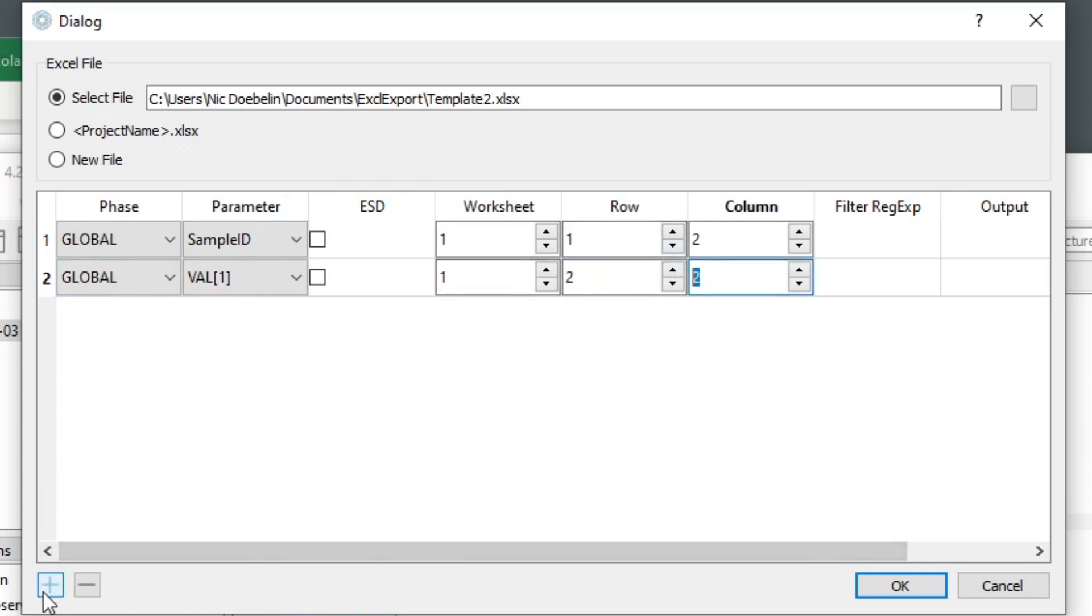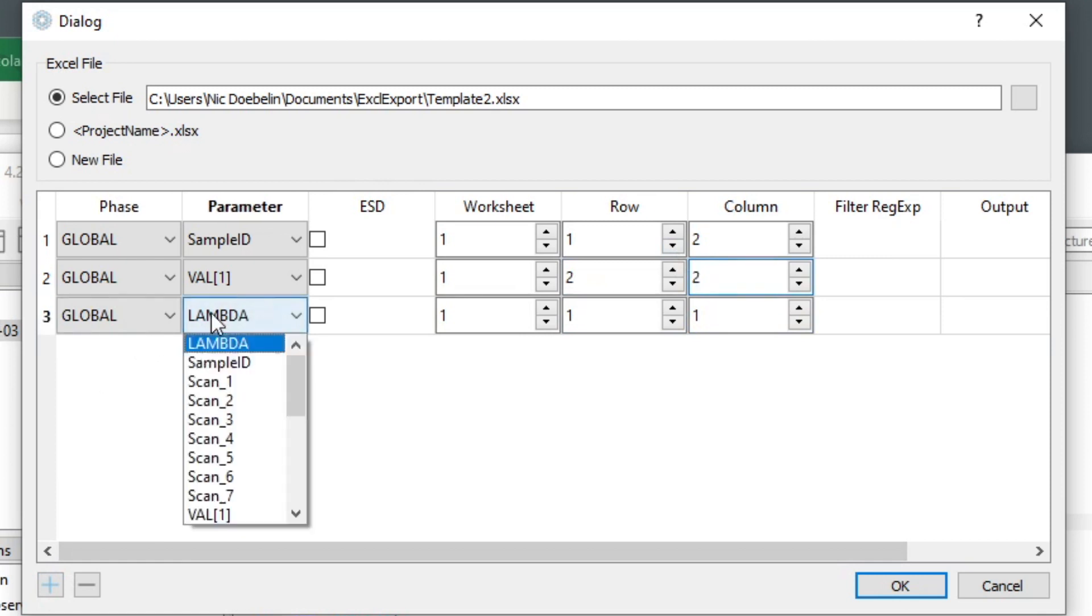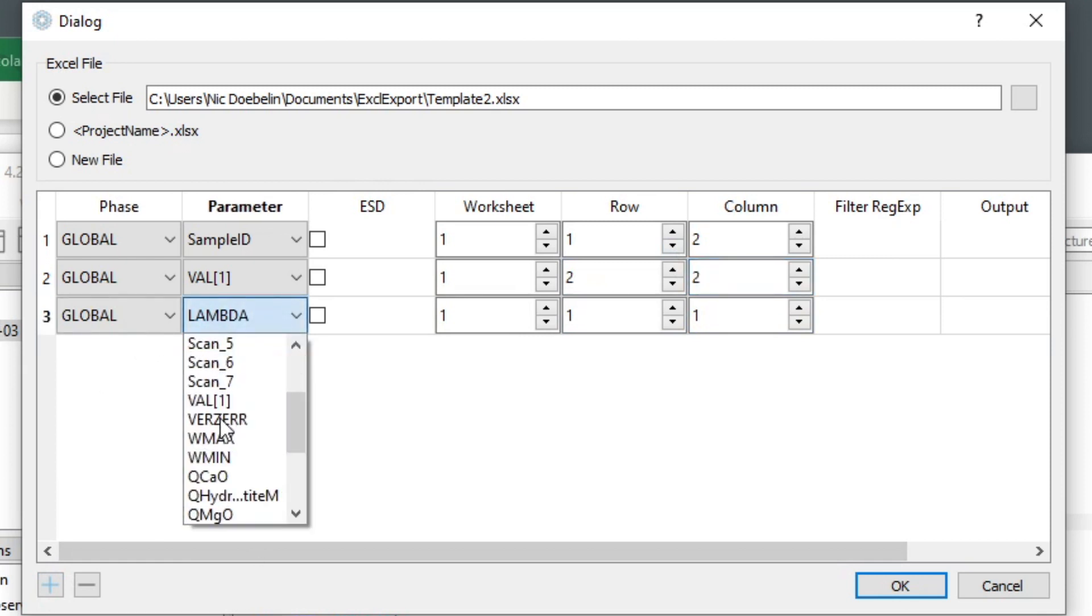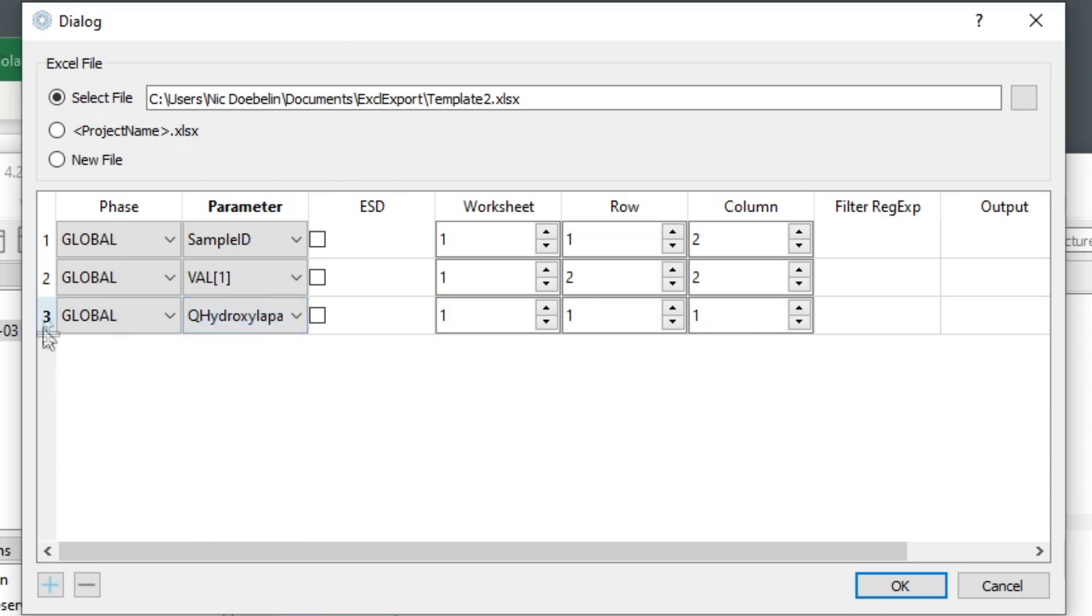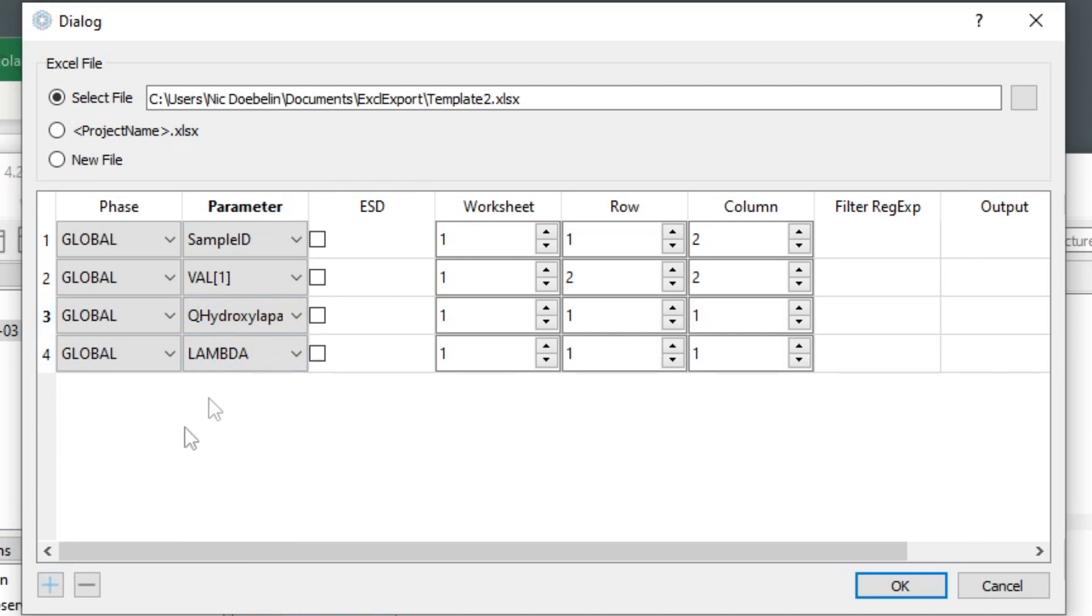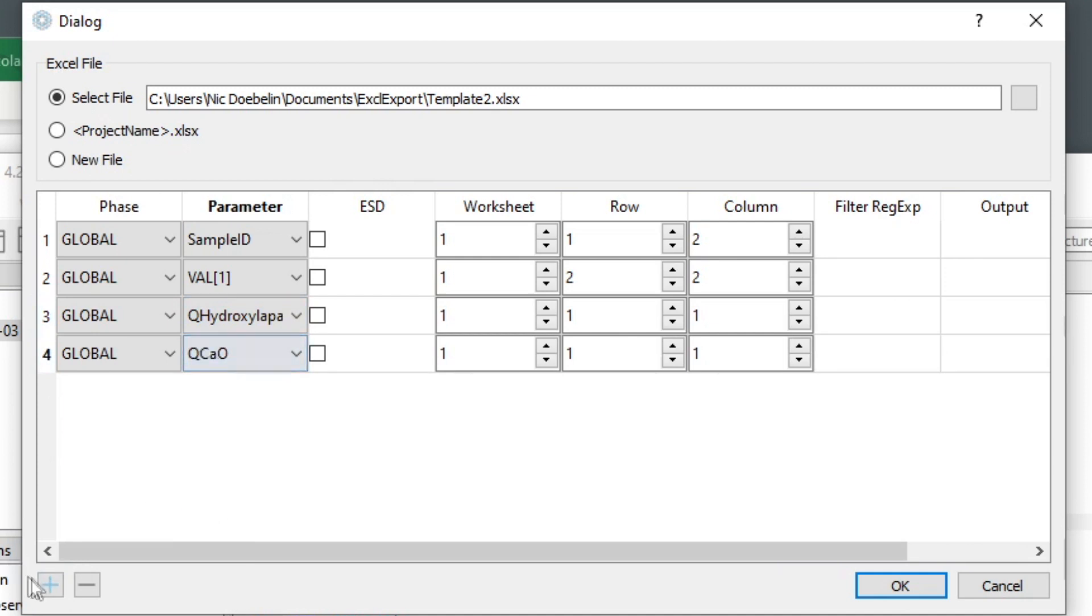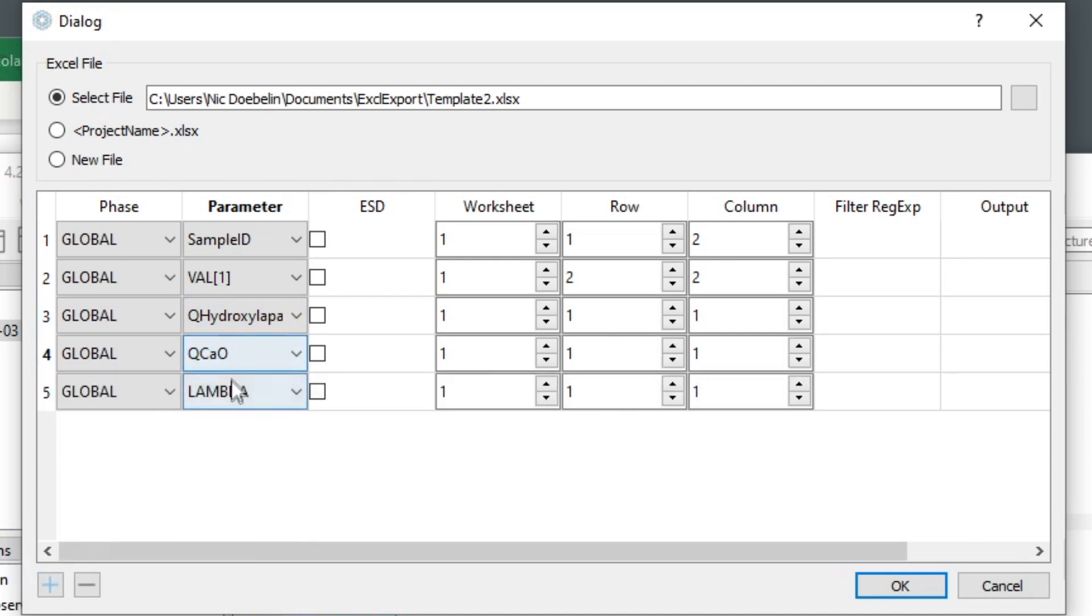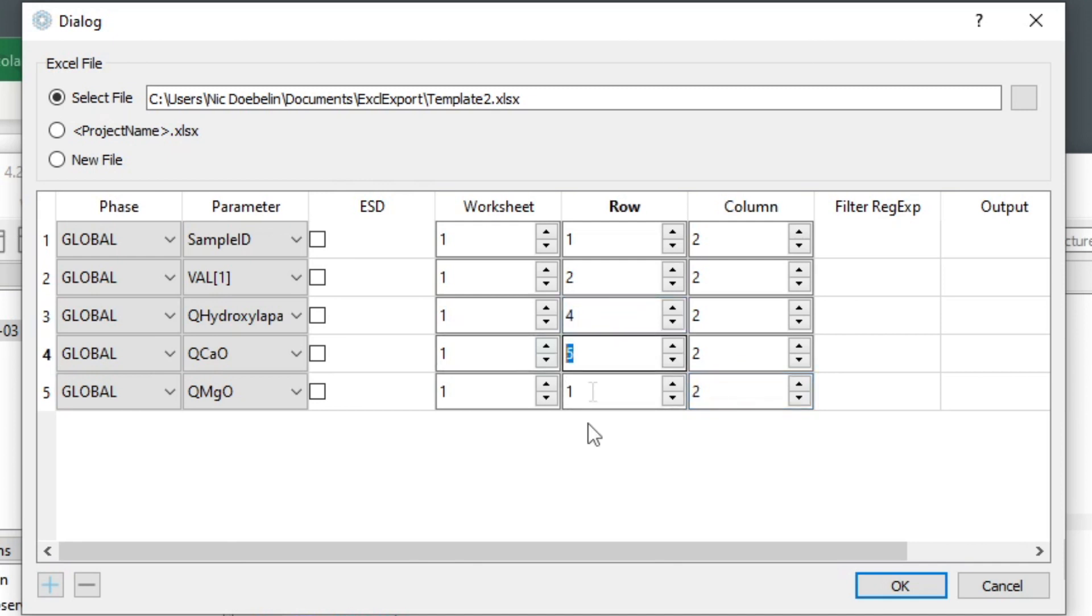And then we add the quantities for hydroxyapatite and all the three phases. This is also a global result. Quantities are global results. Hydroxyapatite, calcium oxide, and magnesium oxide. And we want them to all go to column B, but to rows number four, five, and six.